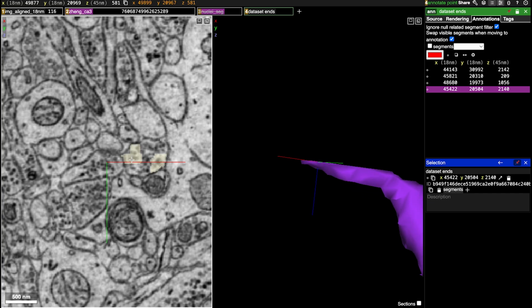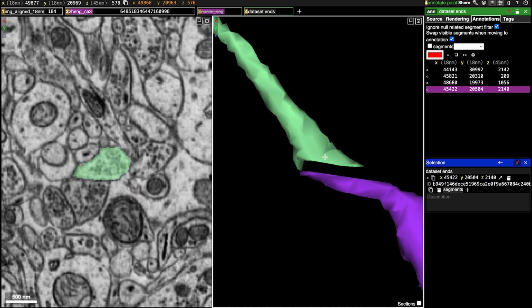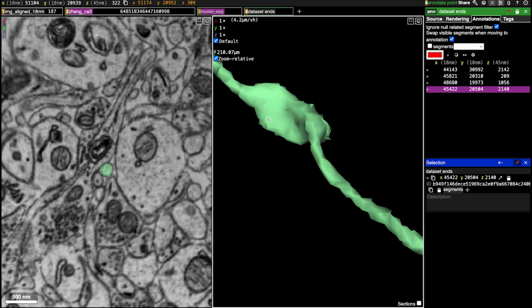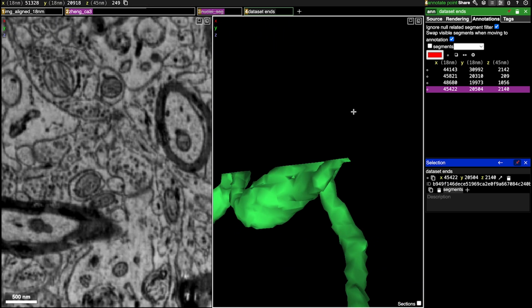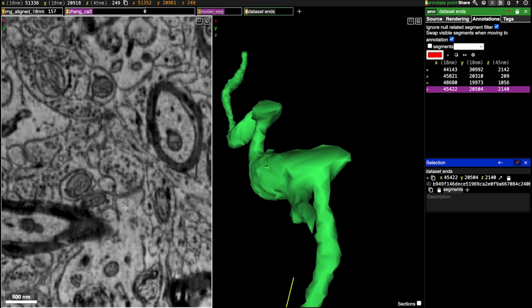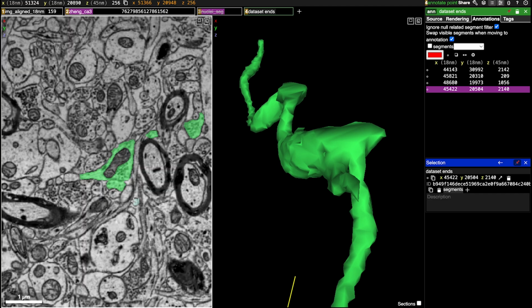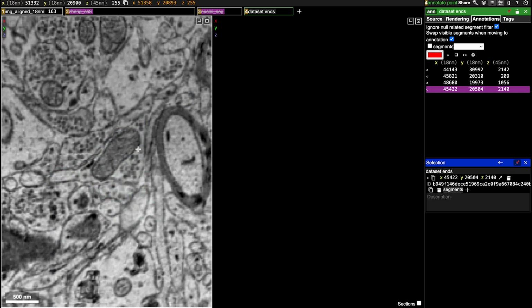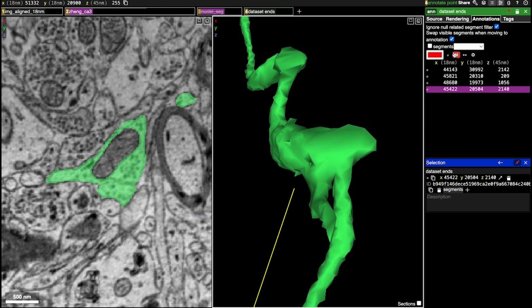And then I'm going to come over here to look at this end. Okay, we've got another flat area here. So let's see. Okay, and it looks like we have an extension. And up here, I'm guessing we're getting close to the edge again. But it's looking like we might have a merger up here. And yeah, we can see, if we turn off the coloring, we've got these two objects. So those are a merge area.